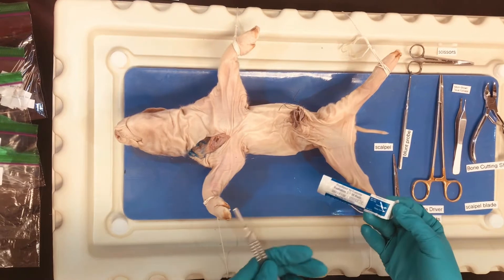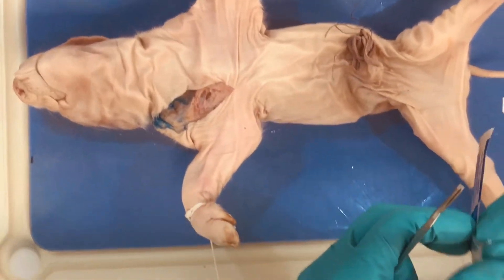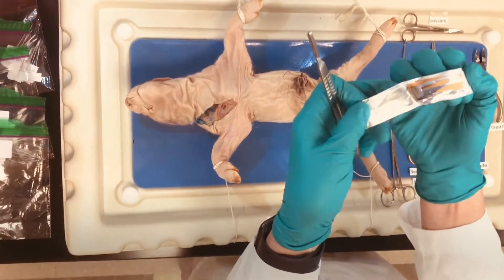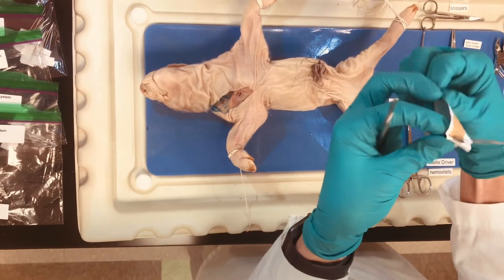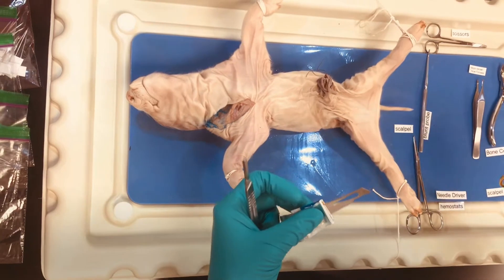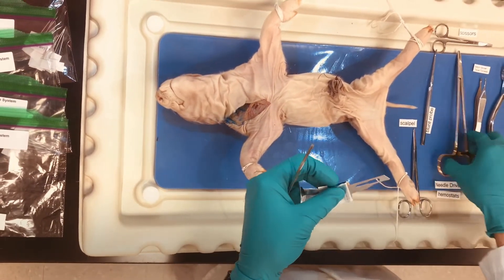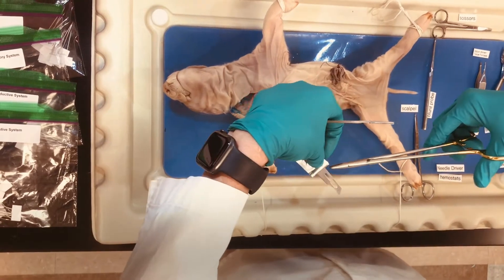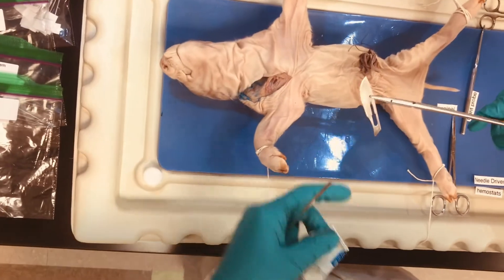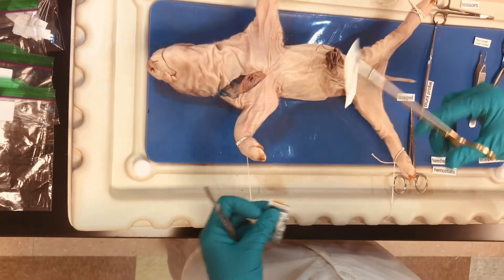When you are going to use your blade, it's important to appreciate that this is a sharp instrument. You're going to peel this open kind of like a banana and you don't want to be touching the sharp aspect of the blade itself. Then you can take your needle drivers or hemostats, depending on what instruments you have available, and grasp the alternate side to the sharp edge of the blade. Clamp down so it locks so this doesn't slide within your needle drivers.